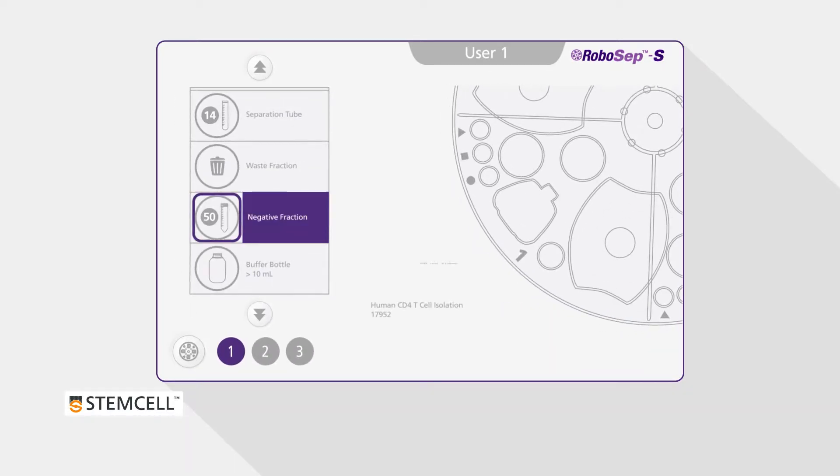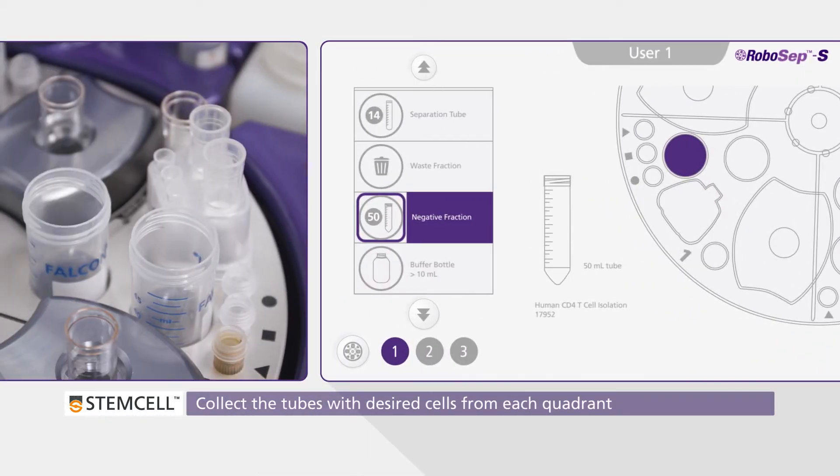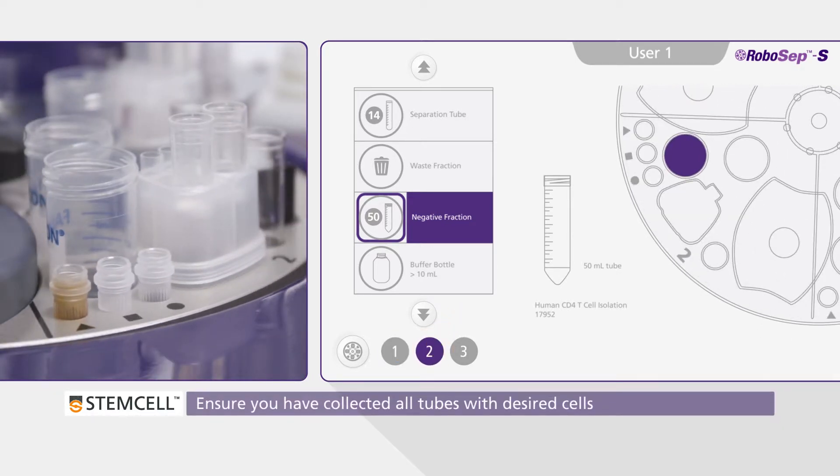On the screen, the location of the tubes containing the desired cells will be highlighted in purple. Click on each quadrant icon on the screen to ensure you have collected all of the tubes.